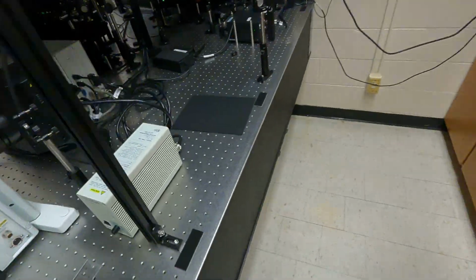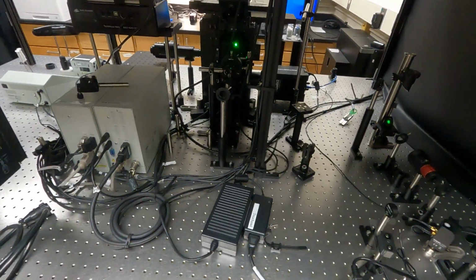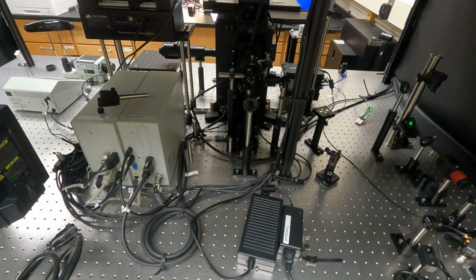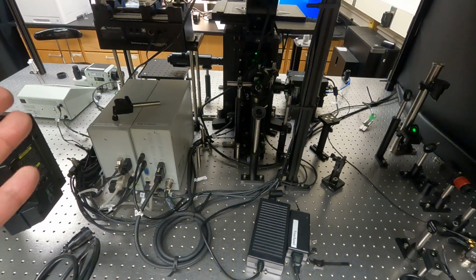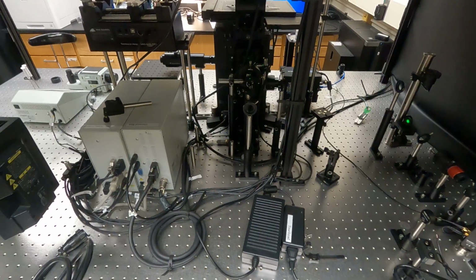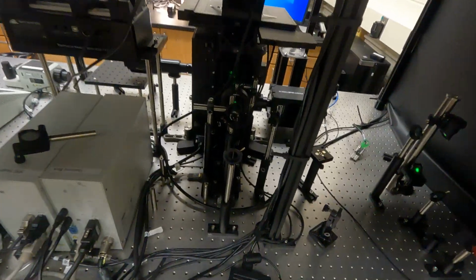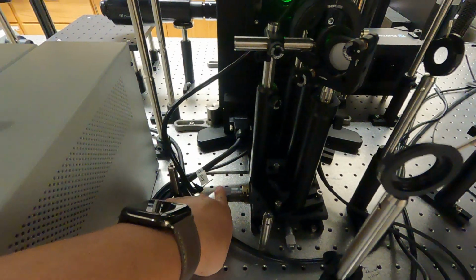We typically set our laser excitation in a mode called total internal reflection. If you took my single molecule courses, then you should know what this means. We have this excitation geometry set up for this microscope. It is actually interchangeable between the TIRF mode and the epifluorescence mode. In order to switch between these two different modes, all you need to do is adjust this knob.